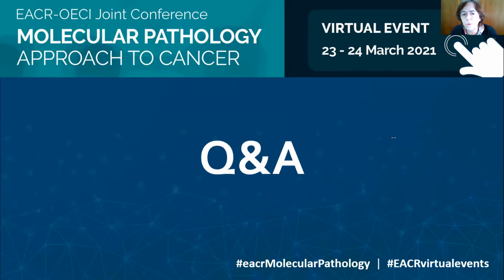And a last one about, I think you answered that also, but if there is any specific instrumentation required, I think you already mentioned that as well. So it's not really. You have the cryostat or microtome, depending on if it's FFPE or fresh frozen. Then you do microscopy, so you take an image. You might need an automated stage if you don't have that, because it's quite a large area to image. Then you go into the molecular biology, which means you need PCR machines and just standard equipment. And then in the end, a next generation sequencer, which you might have in-house, or there are a lot of core facilities out there or service providers that can help you with that.